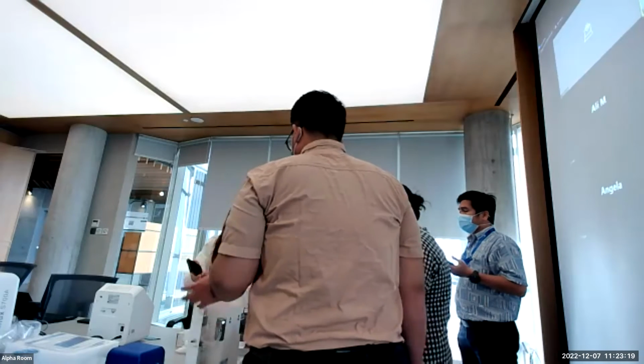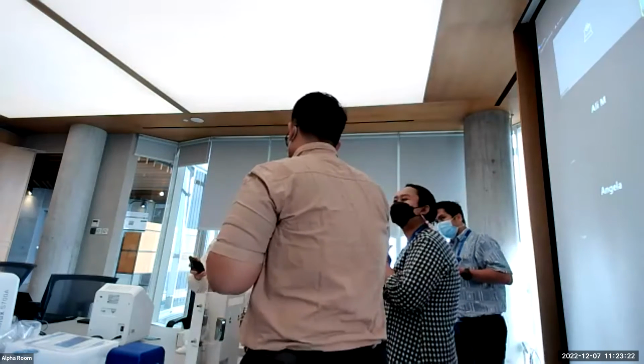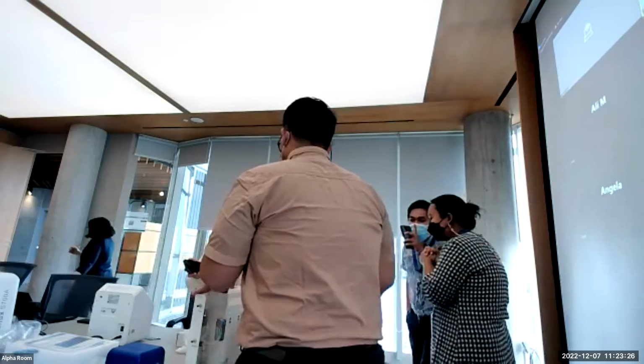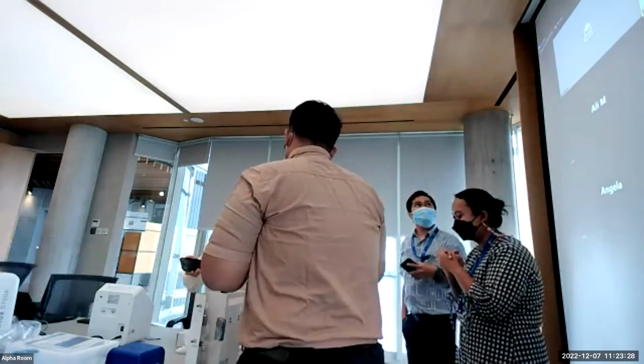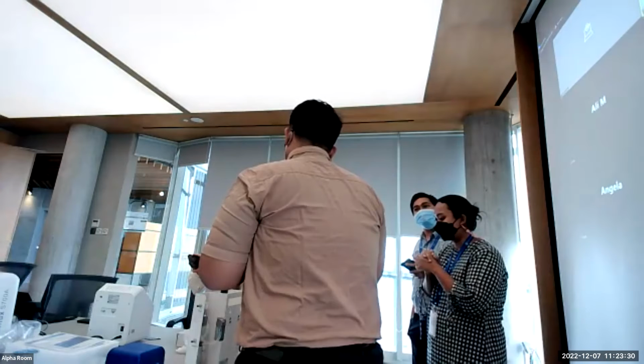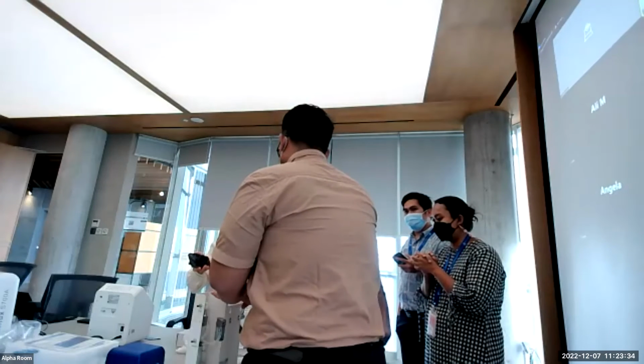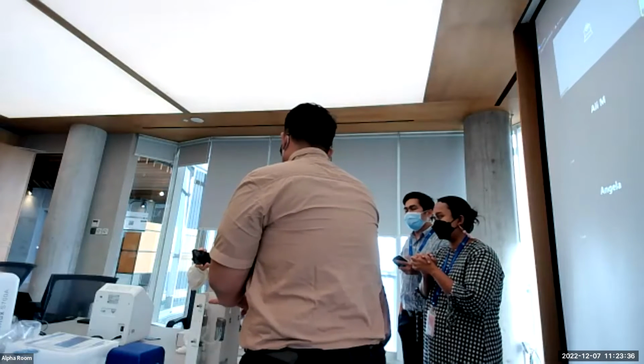I mean, just now you mentioned in the slide, right? For the large animal anesthesia machine, it can anesthetize animals up to 100 kilograms. Yeah. For this one, how many kilograms is the maximum for the animal?